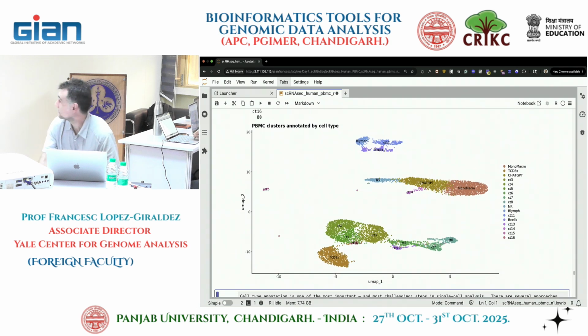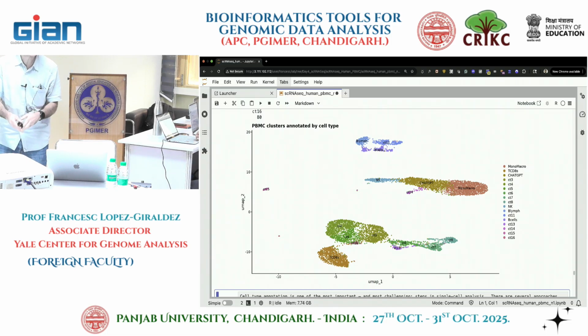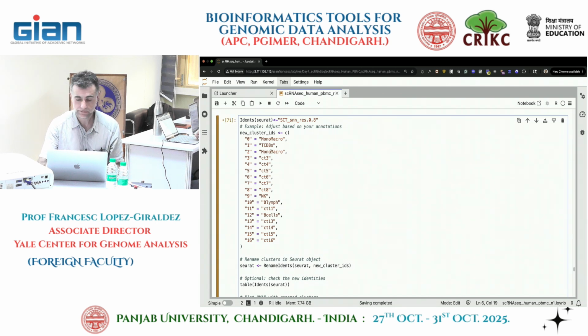It's a bit flat, but it looks like we have the macrophages, monocytes, right? Cluster 2 is also monocyte. Oh, ChatGPT said it is also monocytes. It could be next to each other, right? That could be a good merging. Do you want me to merge them so we see how it happens? We're going to keep the same name. So was cluster 2 also macrophages? That's what we're going to say. So exactly the same thing.